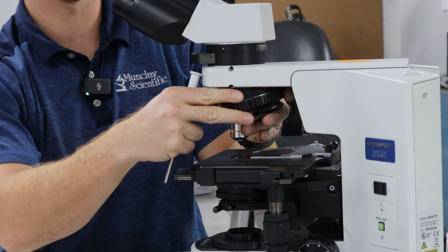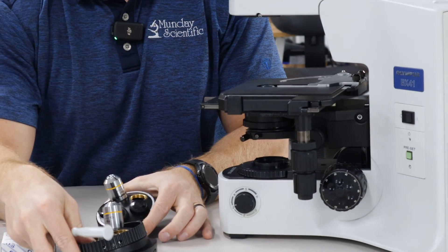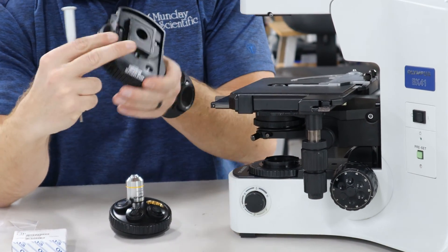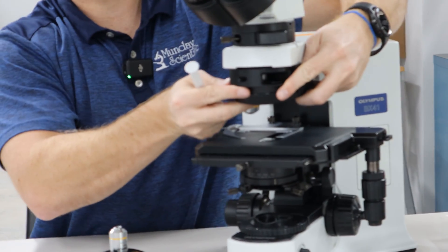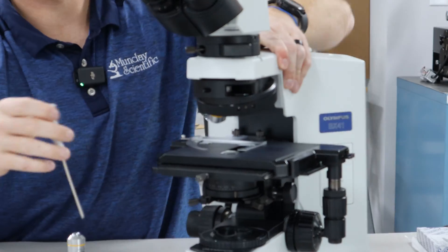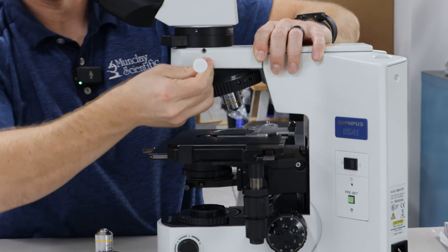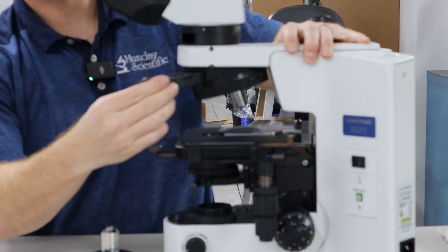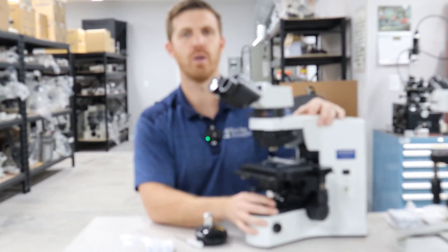Slide that out on the dovetail, move your objectives over to your new nose piece that you purchase. Then it slides right in. You'll want to lock the nose piece back in. And that analyzer will go right in there. Once the analyzer's engaged and your polarizer's there, you can cross the poles.